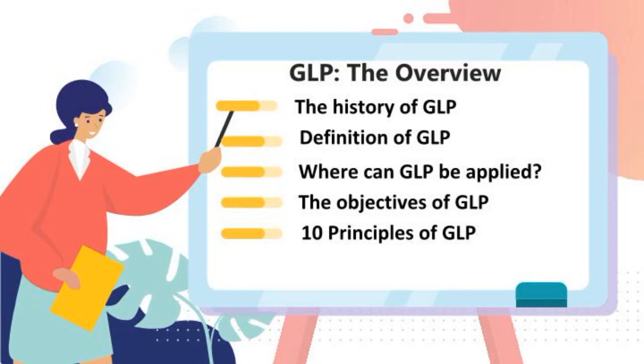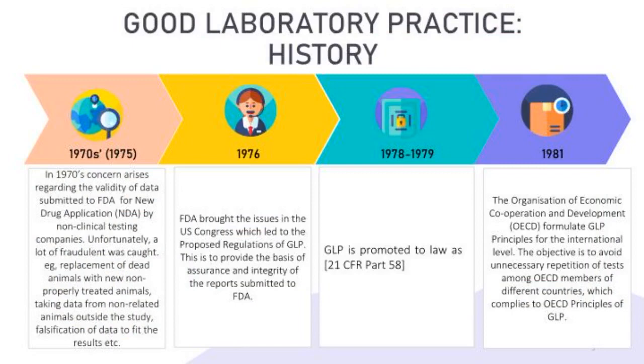GLP definition. Where can GLP be applied? The objectives. And finally, the 10 principles of the GLP. Before we go deeper, let's have a look at the brief history of GLP. Well, it all started in the 70s, when controversial issues arose due to several fraudulent cases.